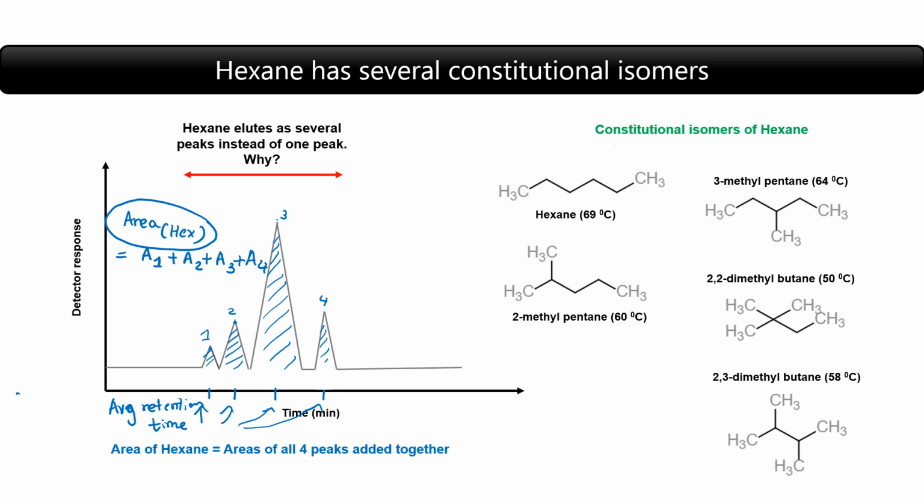because they were separated solely based on their boiling points, because they didn't have any differences in their polarity, right? So they were solely separated based on their boiling points. Try to explain what the retention time is, and try to explain how the composition can be determined by looking at the areas under the peaks. So you can make those kinds of comments in the discussion.